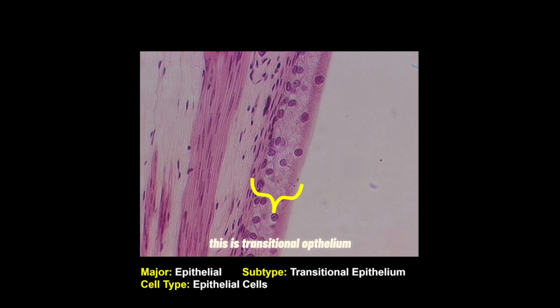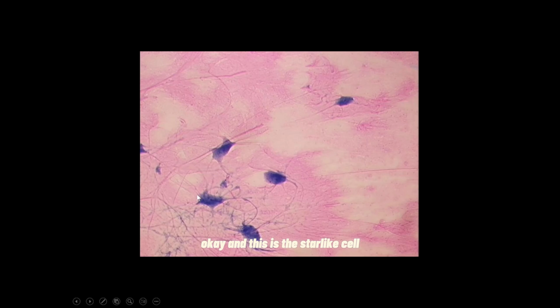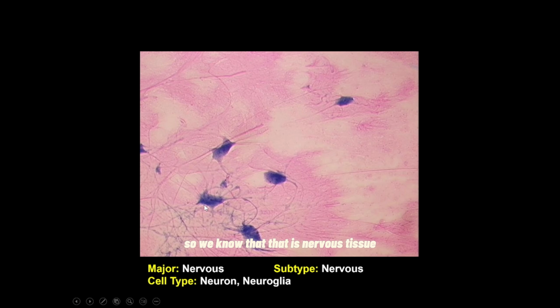This is transitional epithelium. It always is going to be on the end, it looks like. And then this is hyaline cartilage because you can see those two cells joined together. Okay, and this is the star-like cell, so we know that that is nervous tissue.